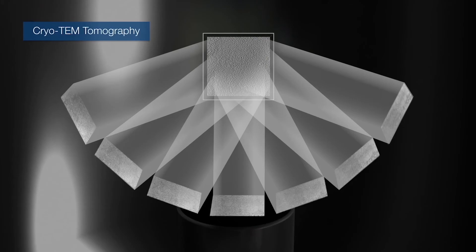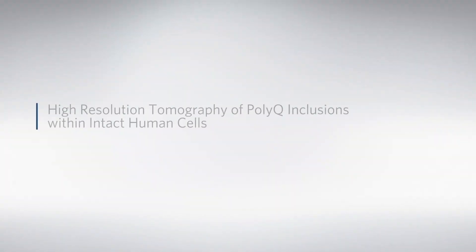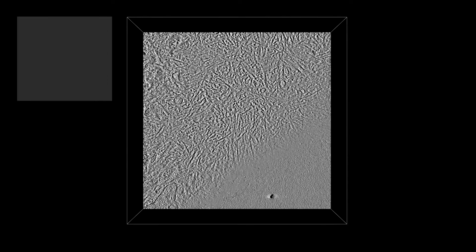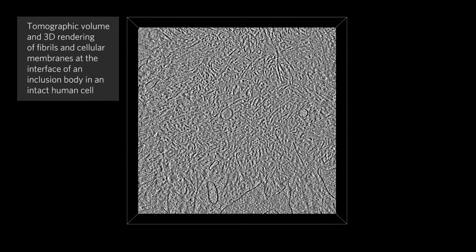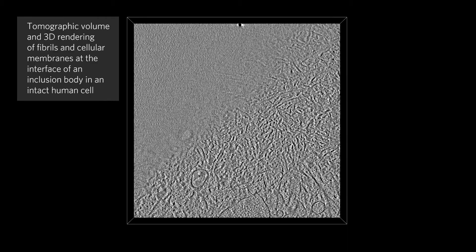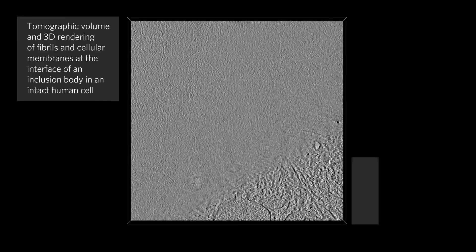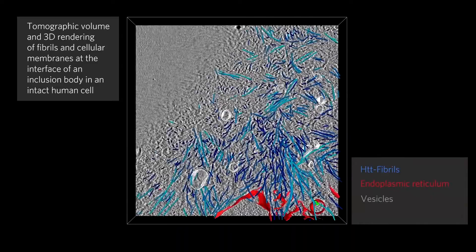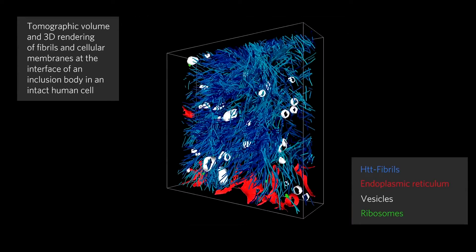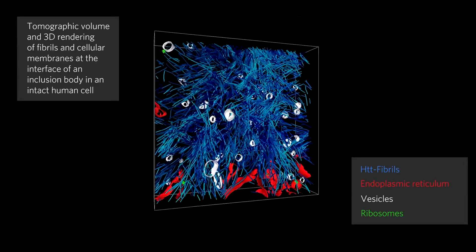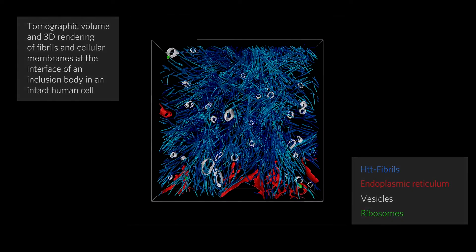These images are then computationally reconstructed to produce a high-resolution 3D tomogram. We will display two examples of such tomograms. In these examples, the raw EM data is shown first in grayscale, then specific structures are computationally selected and rendered in colors. Here we look at a polyQ inclusion within a human HeLa cell. The inclusion consists of fibrils, shown in blue, and these fibrils interact extensively with different cellular membranes, especially those of the endoplasmic reticulum, shown in red. Fibril-membrane interactions lead to membrane deformation and perhaps rupture.